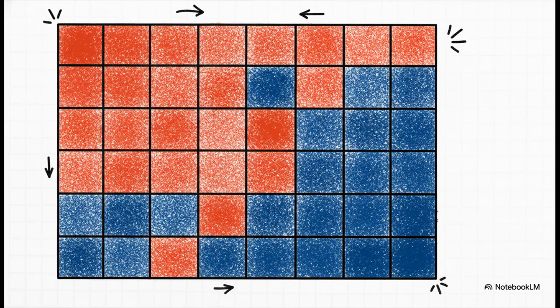Next, we can also generate what's called a heat map. Imagine a grid where every row is a single gene and every column is a different sample. Blocks of dark red instantly show us genes that are running incredibly hot and active, while deep blues show genes that are turned off or running cold. This is amazing because it instantly allows us to see patterns, clusters of genes that are acting identically within our treatment groups, which helps reveal hidden biological pathways.